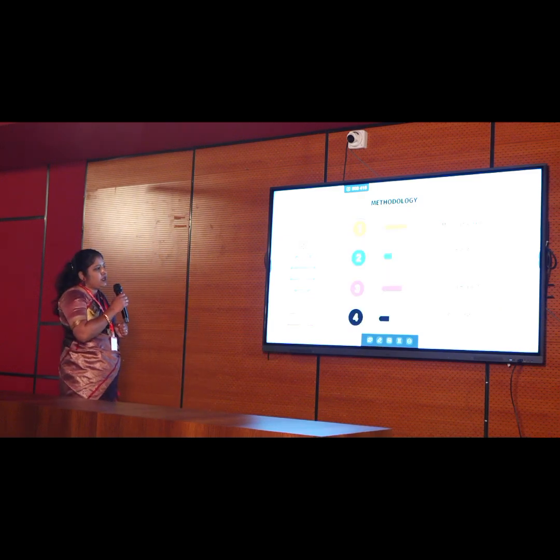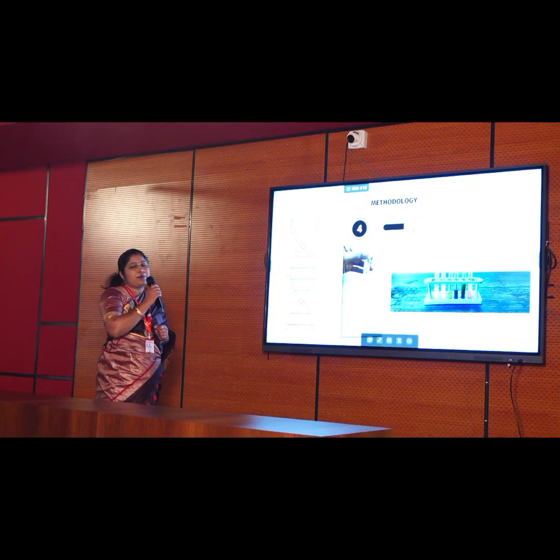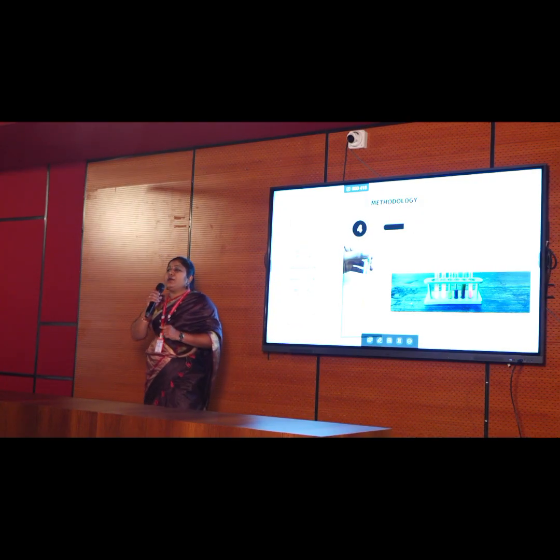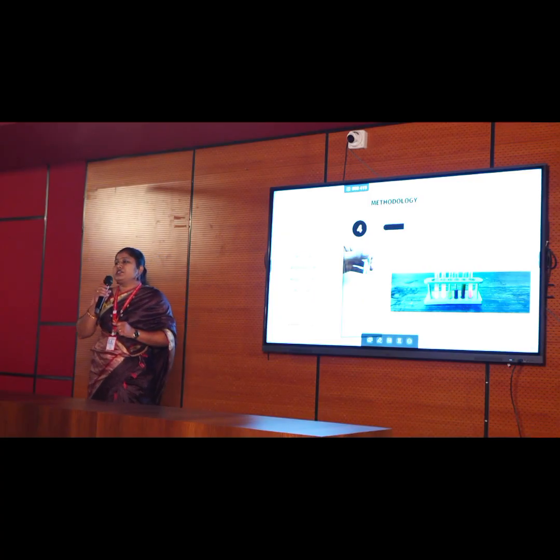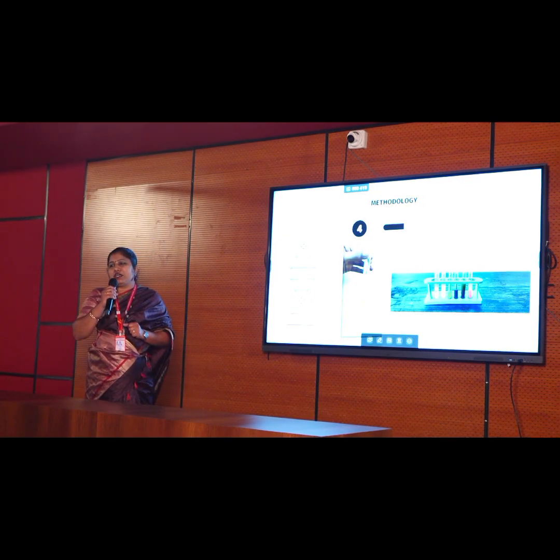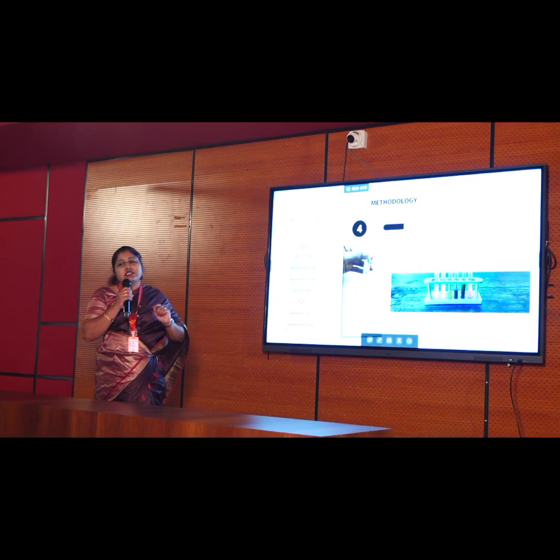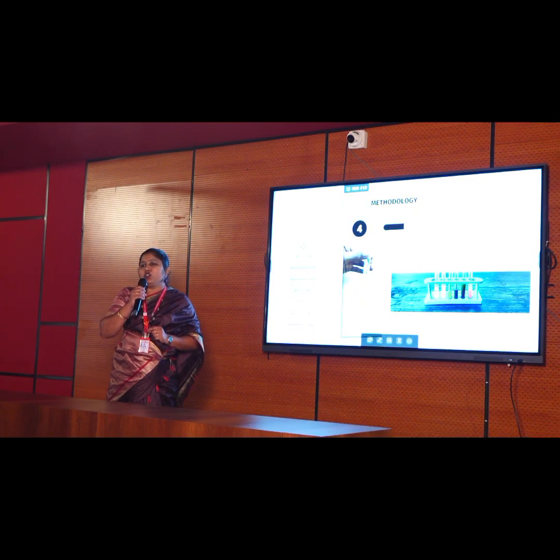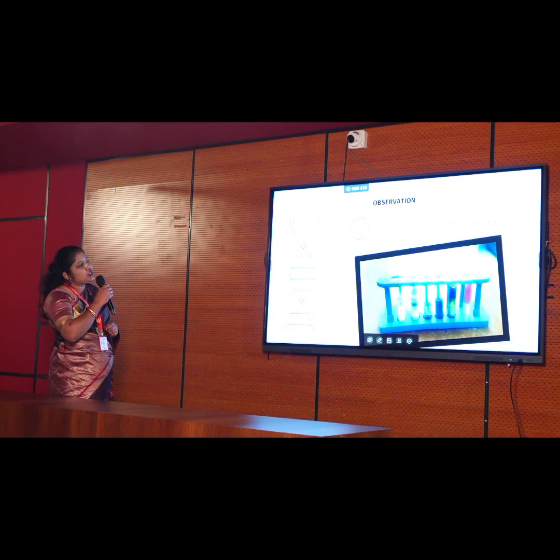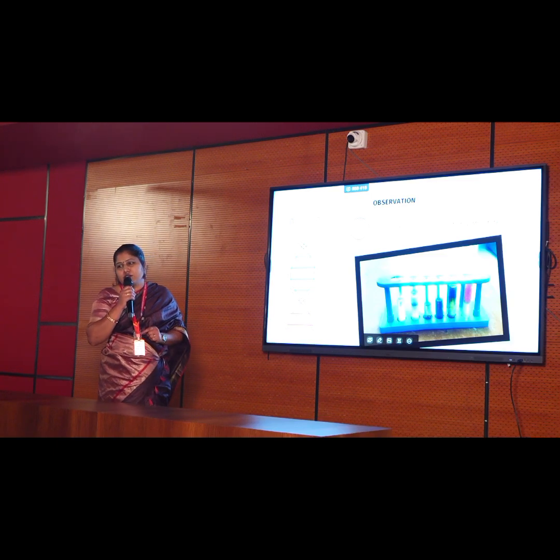Finally, the precipitation, as I said. As you can see, two layers have been formed, wherein the top layer, which is one phase, is nothing but your DNA which is extracted. All the samples of fruits, vegetables and flowers are displayed in the test tubes, which our students have worked with. We extracted the DNA, which forms a separate layer on top of the test tubes. The observation is that DNA looks thread-like, cloudy, floating at the interface between the two liquids.